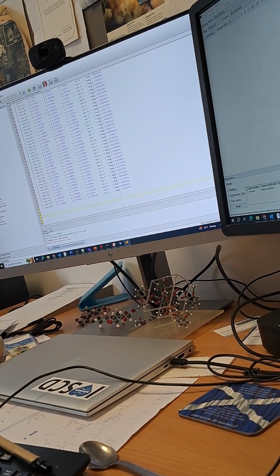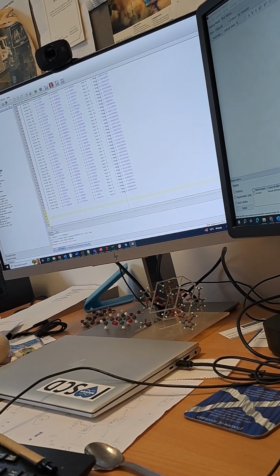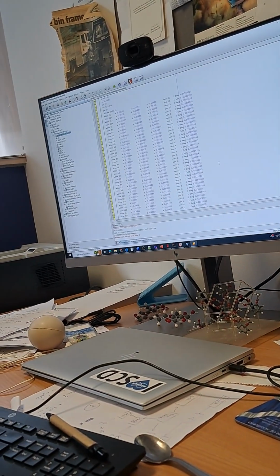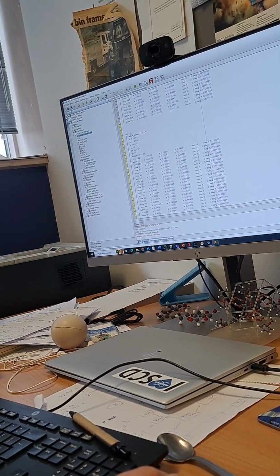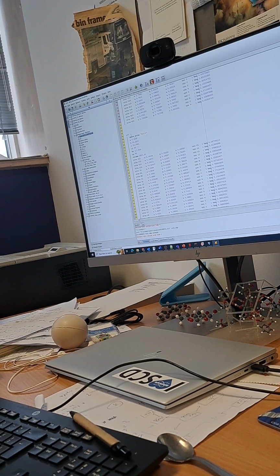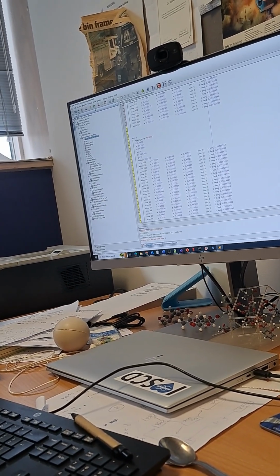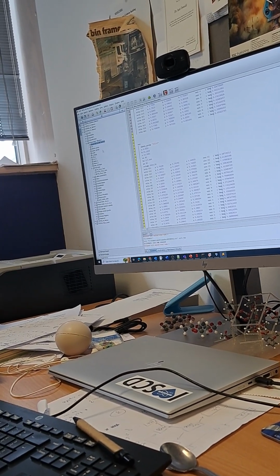Okay, so we can go back up here, insert CIF. We're adding in the phase level CIF, so we can go open with that. Now you can see that's entered as another structure underneath it. It's using the same XDD, the same diffraction file, but you're adding in multiple phases now. Fine.